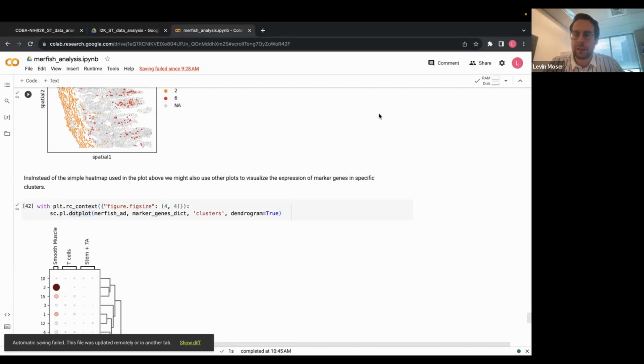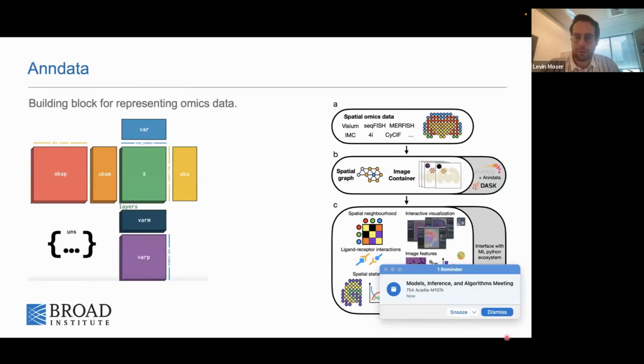And then, another question: do you know of any spot calling algorithms that can decode dual fluorescent label objects? Honestly, no, I don't. Merlin, not, I would say.